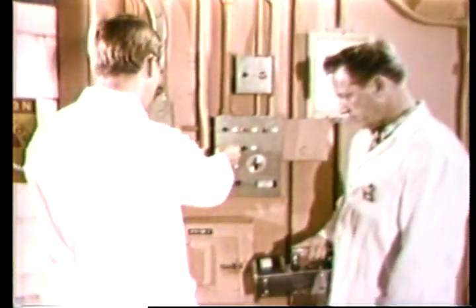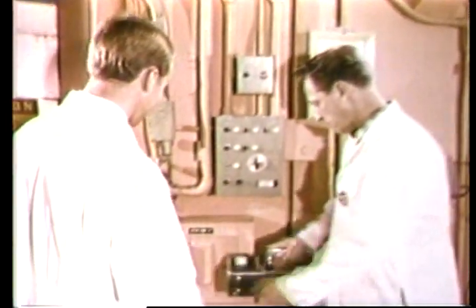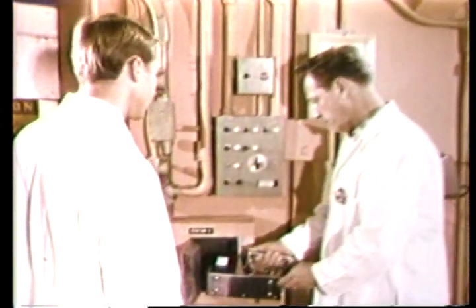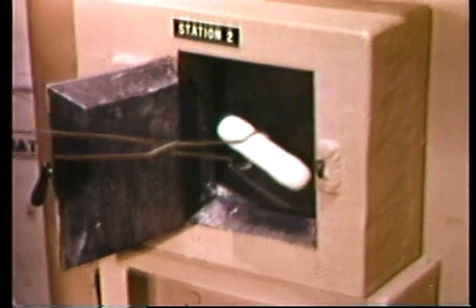After being exposed to the neutrons at the core of the reactor for a predetermined time, the rabbit, with its now radioactive samples, is returned. The health physicist monitors the radiation level before it is withdrawn. The samples will be transferred to a lead container, labeled and hand-carried by the examiner back to the FBI laboratory.